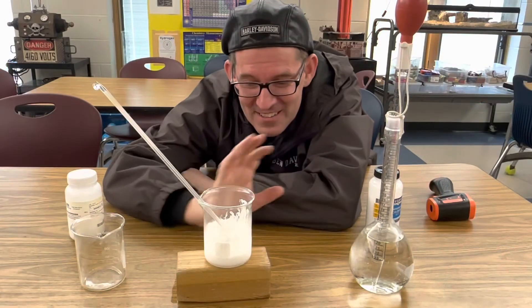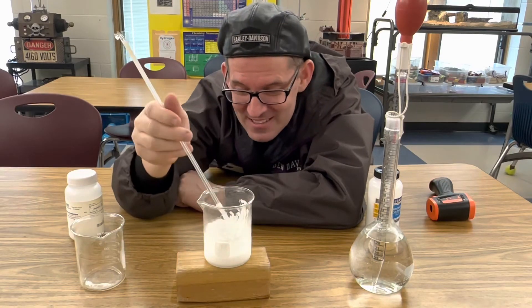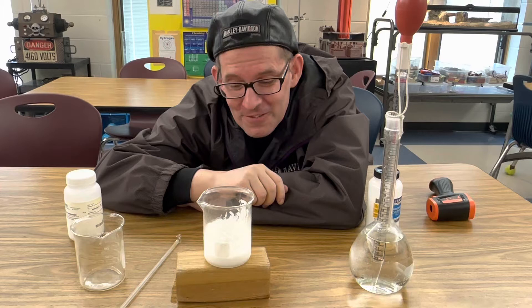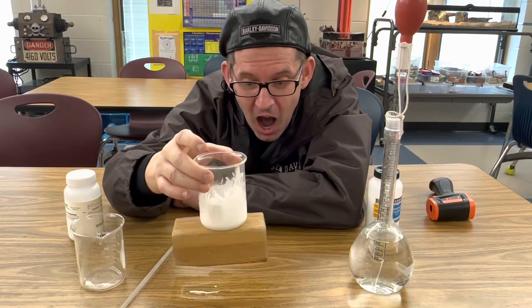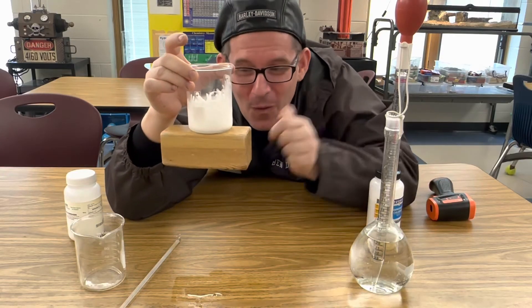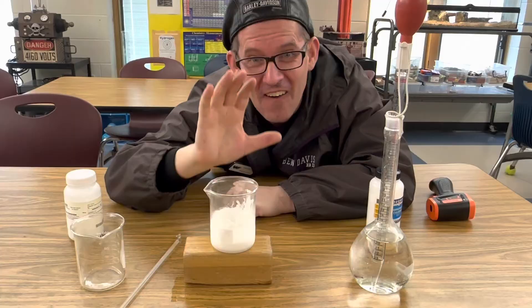So now it's gotten really cold. I'm feeling the outside of it — it's really cold. I want to see if this endothermic reaction actually absorbed the heat from the water that we put on the block and froze the block of wood to the beaker. So I'm going to slowly lift it up. Check it out — it is frozen to the block of wood. That is cold. That is just amazing.